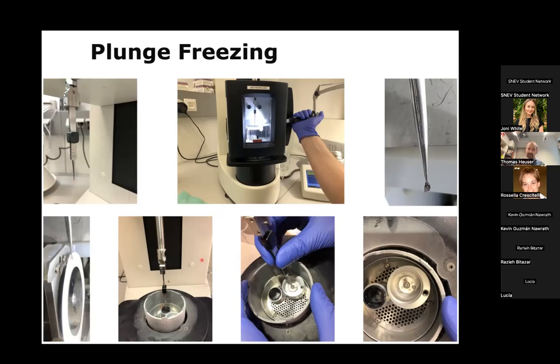The freezing that we're using in this plunge freezing approach is way faster. It happens in a few milliseconds. And this is too fast for the water molecules to rearrange, meaning they're still frozen in this random orientation they have in the liquid phase.